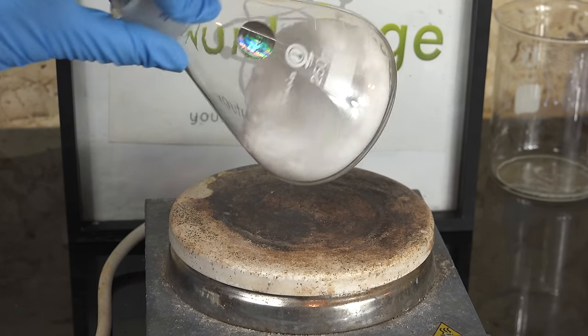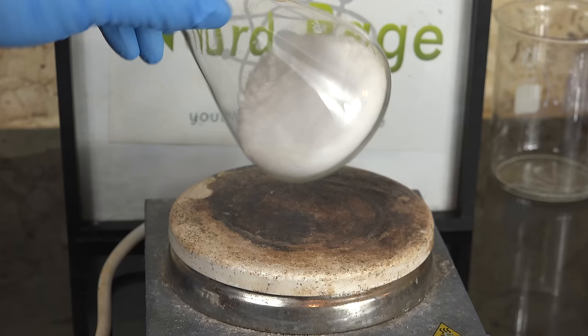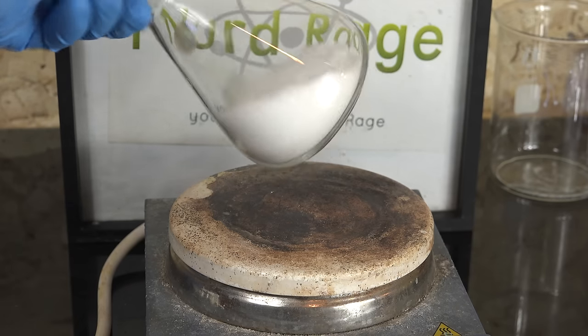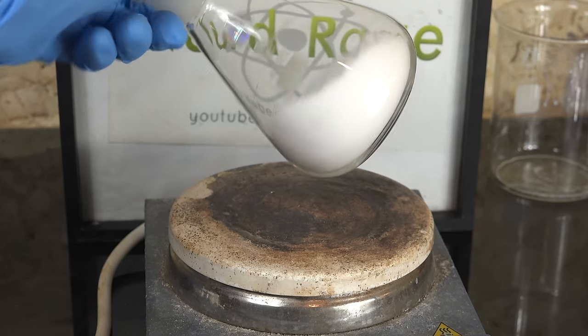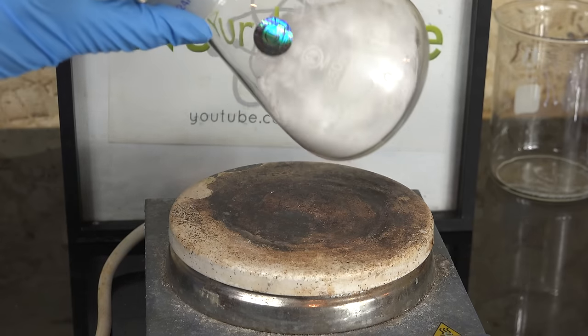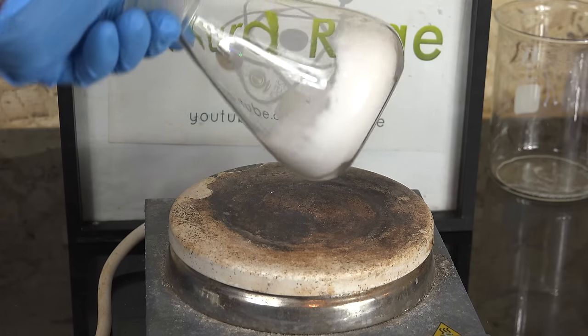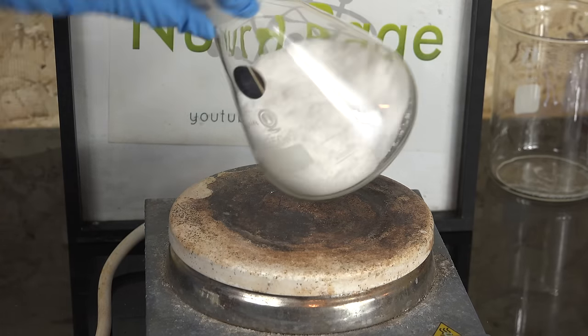Greetings fellow nerds. A quick video on what gloves to use with nitric acid. I've had a lot of comments in my previous videos on nitric acid stating that I was using the wrong gloves and that I was spreading misinformation that could lead to dangerous accidents. While those comments are not entirely wrong, as usual the science is a bit more complex.